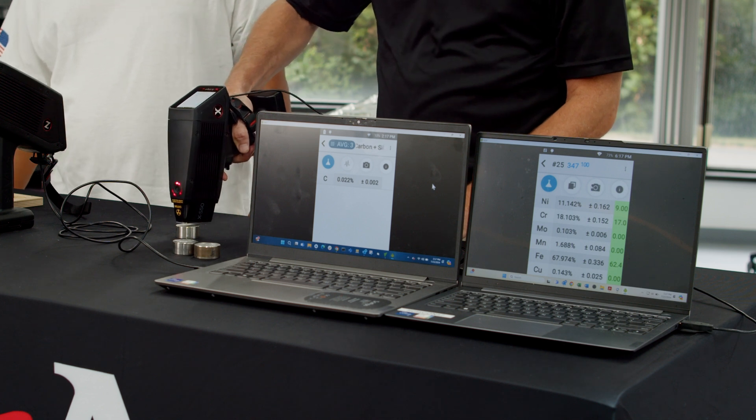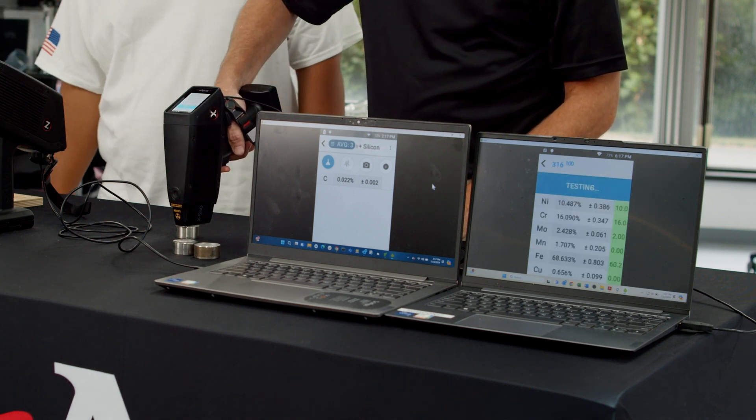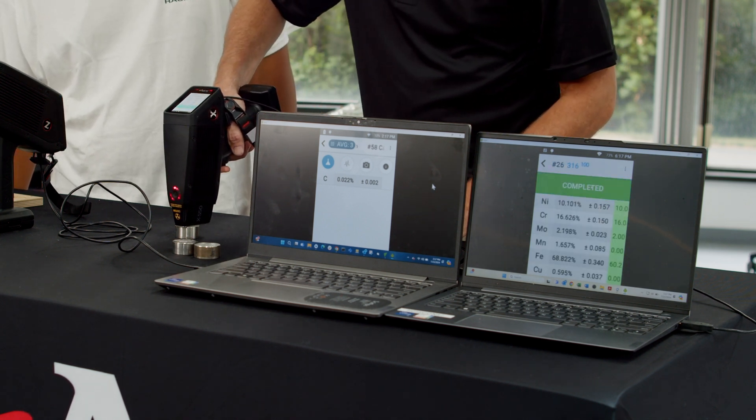If you need to shoot another piece you just do the same thing. We've now sorted the difference between a piece of 316 and a piece of 304.